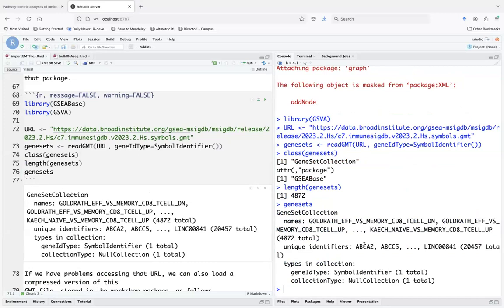Oh God, how can I mark something? Do you see my cursor? Yeah.